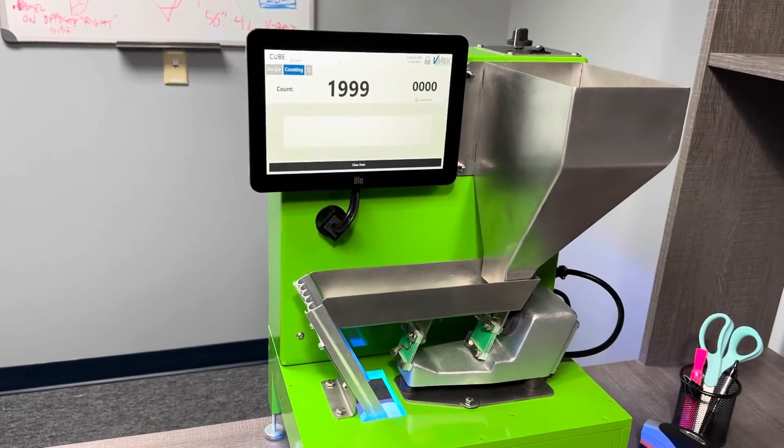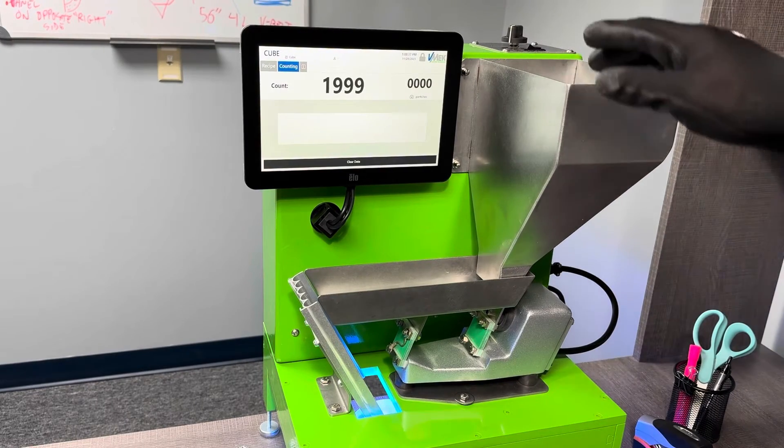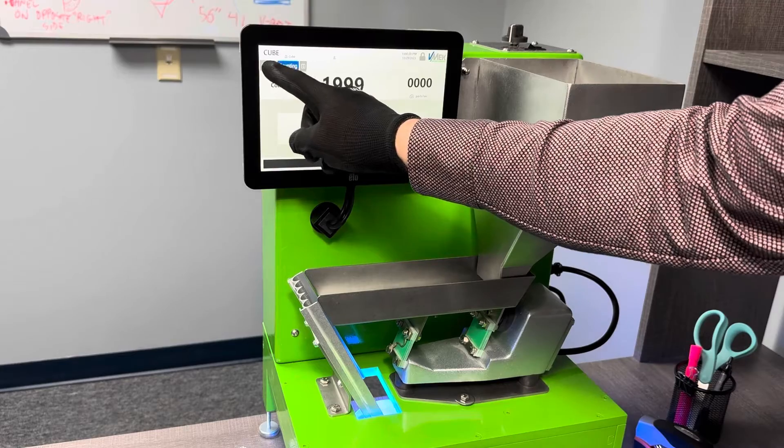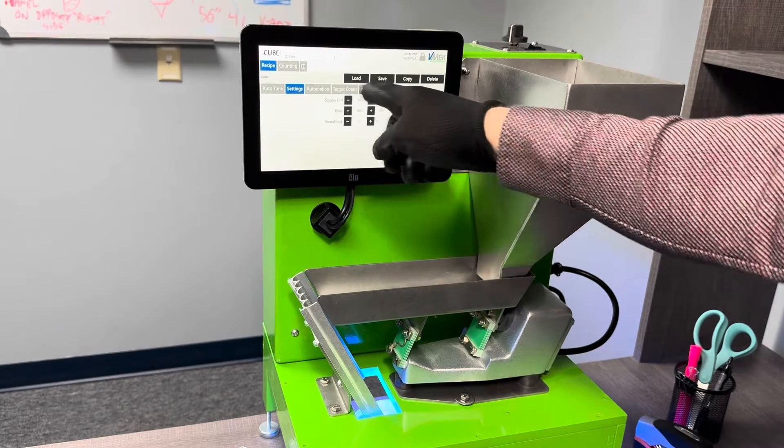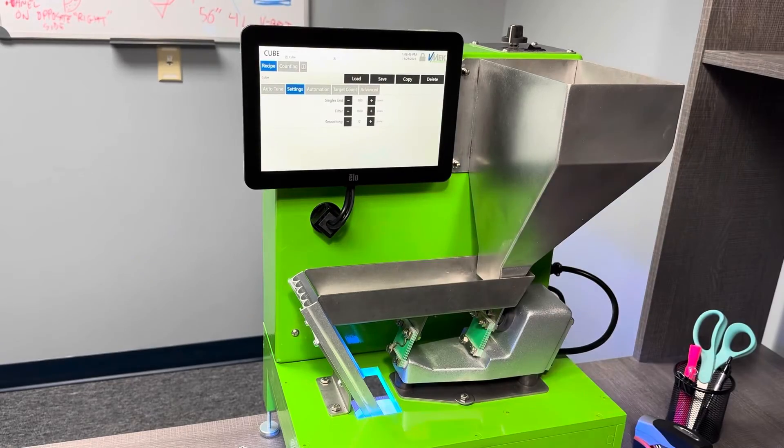So it has the accuracy that you'd expect from a Vmec counter and the functionality as well. Of course, you can change the recipes as well as view the data online.